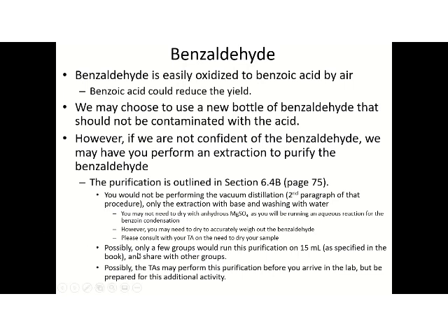If we had the actual lab, only a few groups would run this purification on 15 milliliters, as specified in the book, and then share with the other groups that we have.